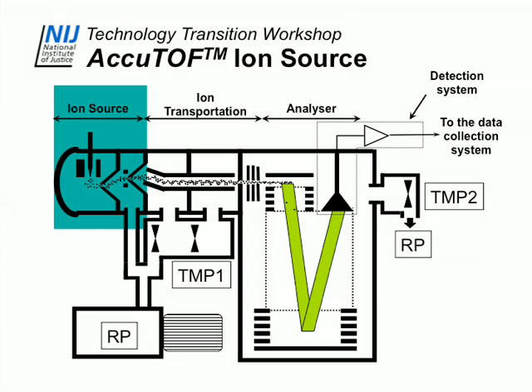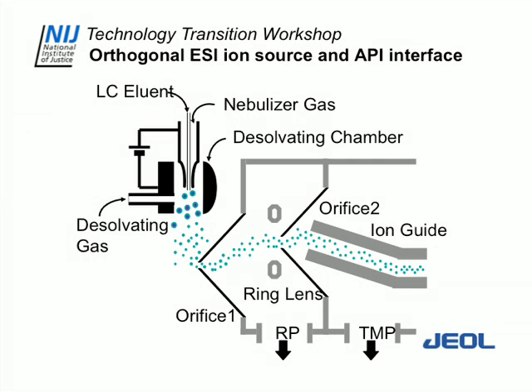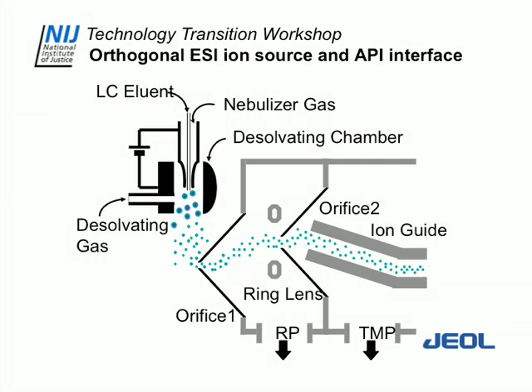Let's take the ion source first. Again, this shows an electrospray ion source, but you could substitute a DART for this and blow the ions in this way. What's really important here is the atmospheric pressure interface. If you've got ions being formed out here, there's a little orifice into the vacuum system. It's a 400 micron diameter orifice on a cone-shaped ring. This ring out here is pretty close to ground potential and has zero current. So if you don't turn the orifice heater up to a high temperature, you can touch this with your finger. There's absolutely no danger of shock or anything like that.